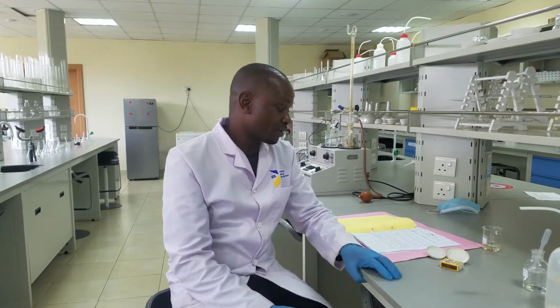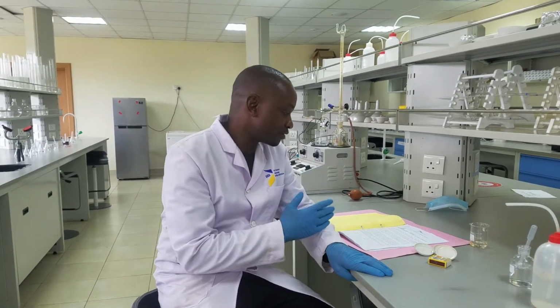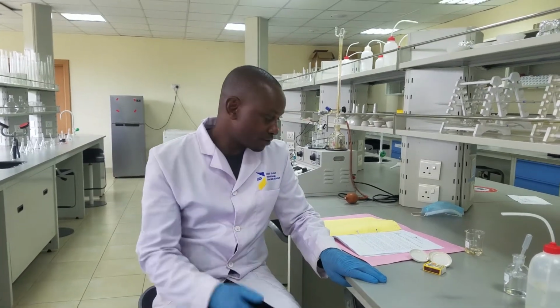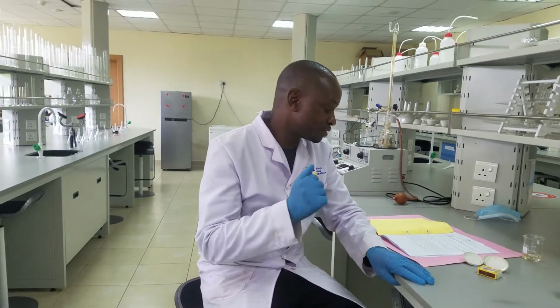And there are different classes of hydrocarbons. We have aliphatic, those are straight chain, and we have cyclic, which are circular in nature. We also have saturated and unsaturated. We can differentiate most of these hydrocarbons by different reactions. Due to the limitation of chemicals, we have only a few of them that we want to carry out with you, but the rest, when you come face to face, we will be able to carry them out, and you see the differences.